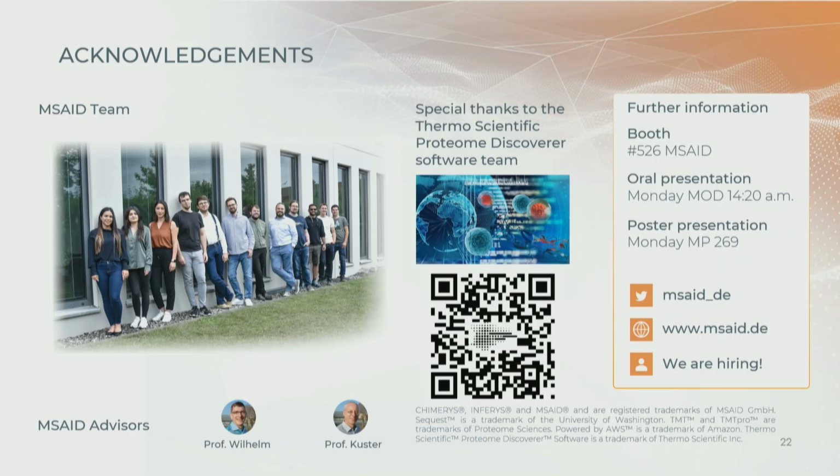So a follow-up question is that in the figure you show more than a 40% increase. What is the isolation window for that data? For the DDA data, you mean? Yes. I believe that was 3.8.